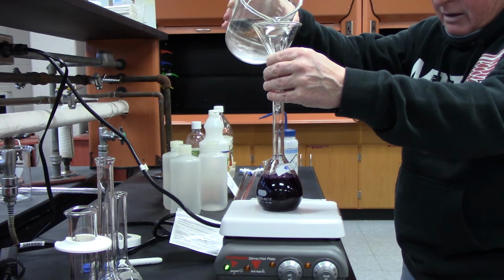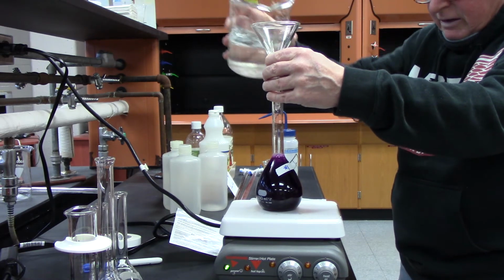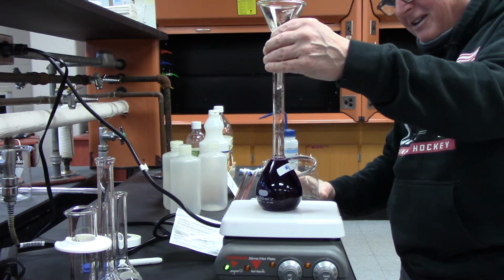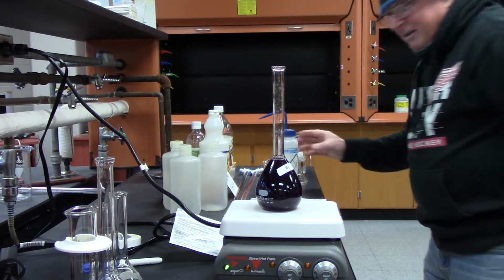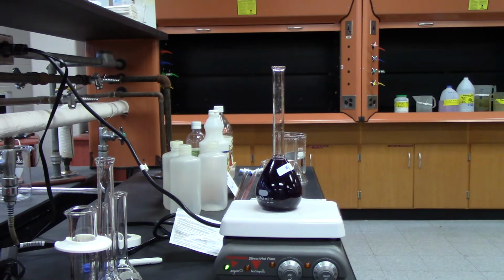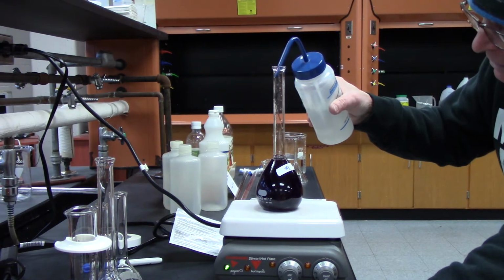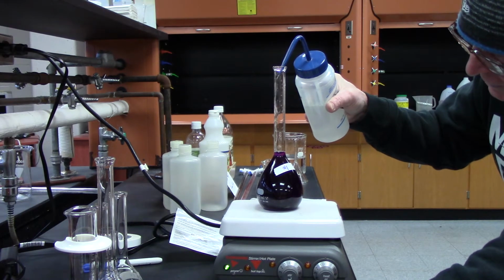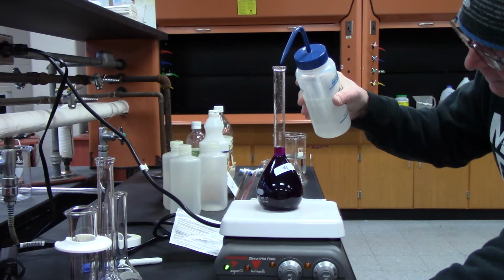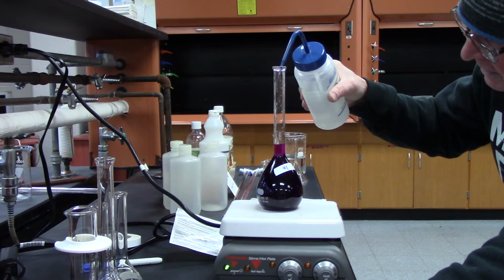So I'm going to add, okay, have to be careful. I don't want to do it again. All right. Okay, I'm not to where I want to be, but I can get there real easy. Now I need to be precise. I'm using a water bottle to get me to where I want to get. So I add water carefully, slowly, because it drips alongside the neck. And you want to make sure you get that neck water.